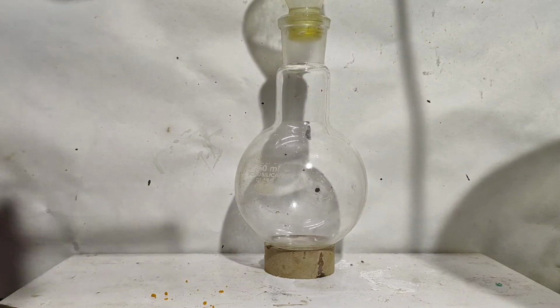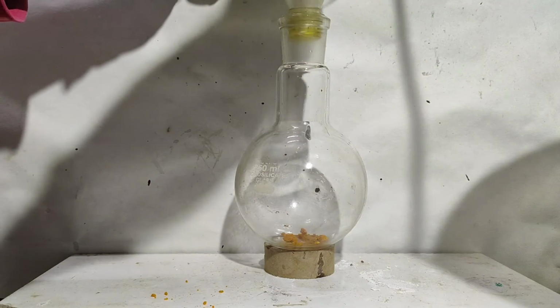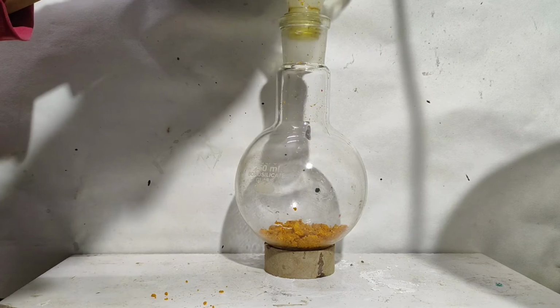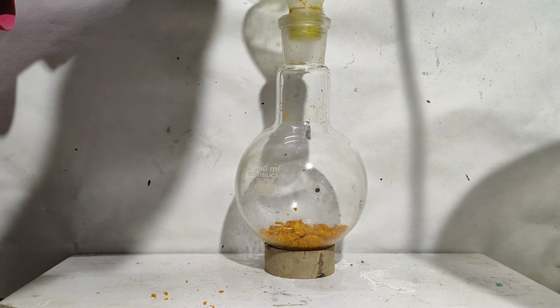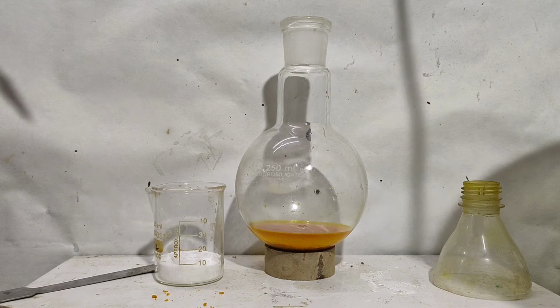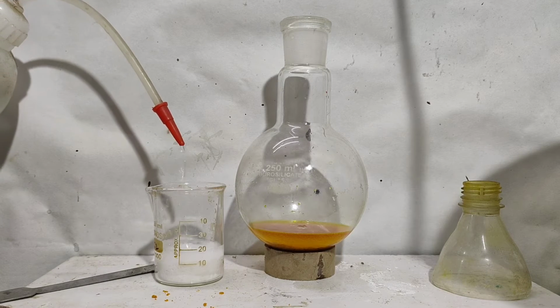The percentage yield being 5%, my nitrobenzene was finished, but I had 5 gram of azobenzene that I had prepared in earlier attempts. I read online that azobenzene can be reduced to hydrazobenzene by sodium dithionite. So I took all my azobenzene in a 250 ml round bottom flask. Now I added 20 ml of methanol to it. Now I measured 15 gram of sodium dithionite and dissolved it in 20 ml of water.